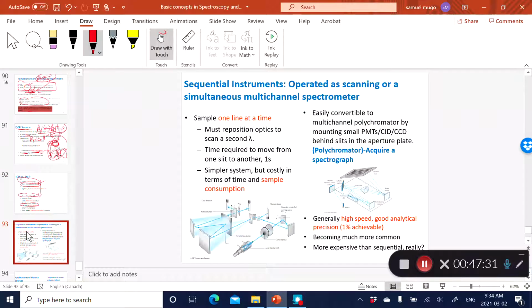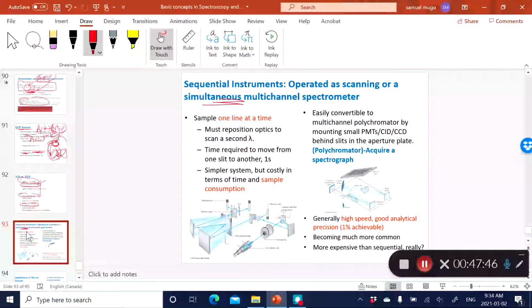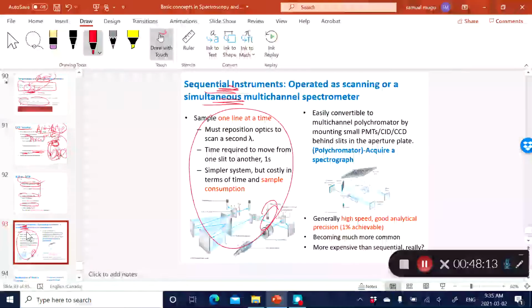So the way you operate an ICP OES, because you're dealing with lots of wavelengths in terms of the spectral lines, okay? That's why you're detecting multiple analytes. So how do you detect multiple analytes based on the detector? You can either run the ICP using the so-called sequential mode. And the sequential mode, as I said before, is where you keep changing the angle of the grating, and the angle of the grating really means that different spectral lines end up in the detector as you keep changing the dispersive element, meaning the grating.